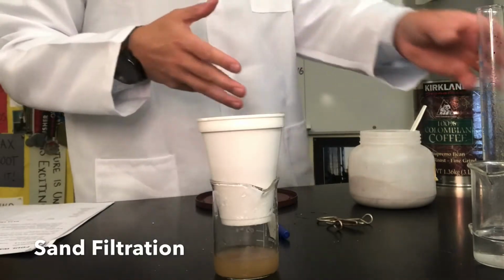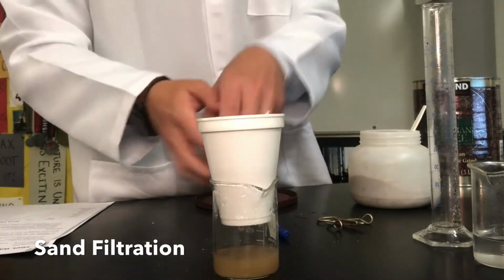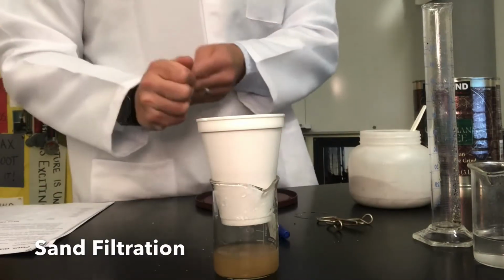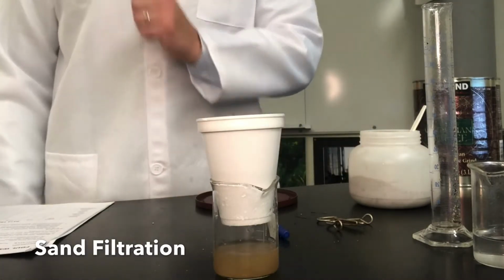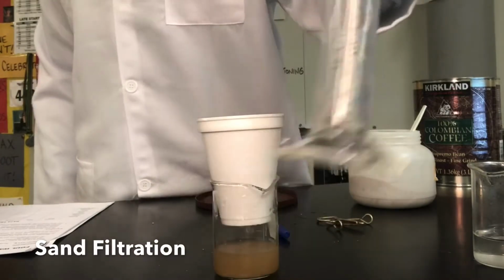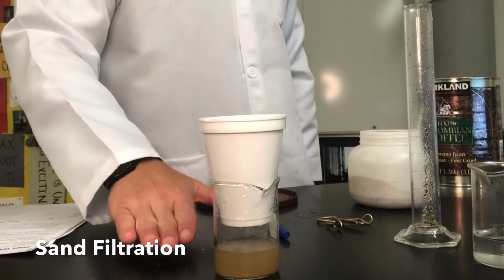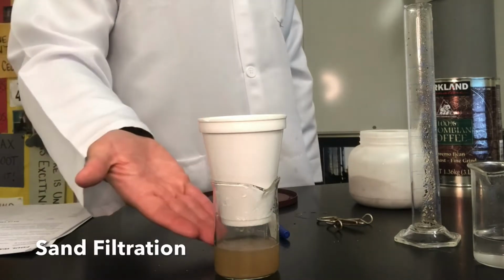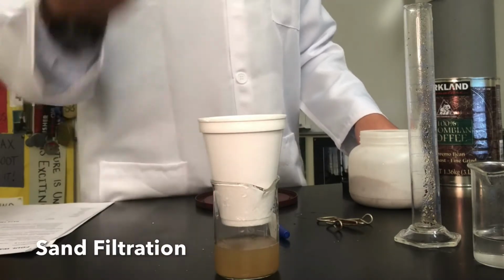So any of those little chunks that we saw inside of that liquid, as gravity pulls the water down, some of those chunks are going to stick to the sand and gravel, and then just liquid comes out. So in the end, hopefully we no longer have any chunks left. Maybe a few little grains of sand, but none of these unidentified chunks, whatever they are. They're black and brown. So we're going to let this sit for about 5-10 minutes and let this naturally settle out so that we can strain this solution and end up with slightly cleaner water. So we'll give that a few minutes and then we'll go from there.